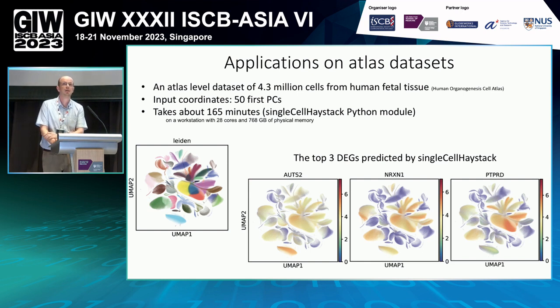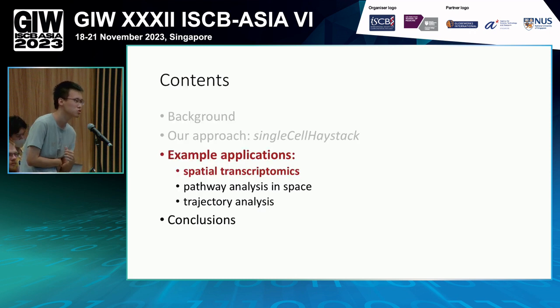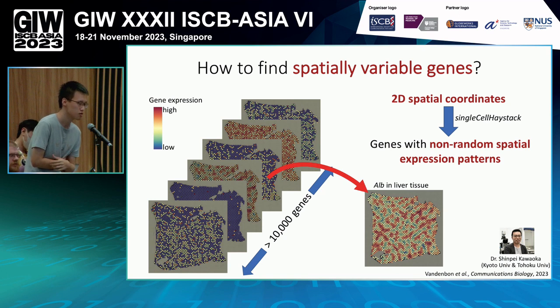Okay, thanks, Prof. Student from US. Very brilliant talk. I noticed that you mentioned spatial transcriptomics, right? You said the tool could be implemented on spatial transcriptomics as well as single cell data. In single cell data, we have the cell gene matrix, and you use PCA and the KL divergence to measure the similarity between two shapes. I wonder if you use the same way for spatial transcriptomics, or you use the coordinates of transcriptomics and do the shape similarity.